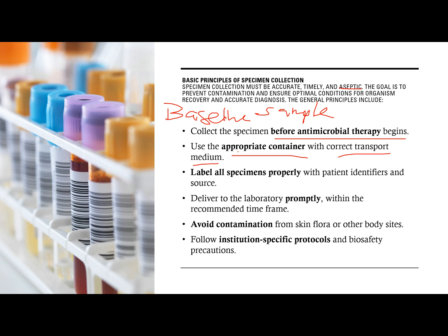Deliver to the laboratory promptly within the recommended time frame. So if the sample is collected, class, at 1 p.m., it has to be in the laboratory within an hour. Nangyayari ito, class, you will encounter this pag nag-work na kayo sa lab in the future or even as interns, wherein the sample was collected at 10 p.m., dumating yung sample sa'yo 6 a.m. So you need to assess yourself if i-accept mo siya or hindi.